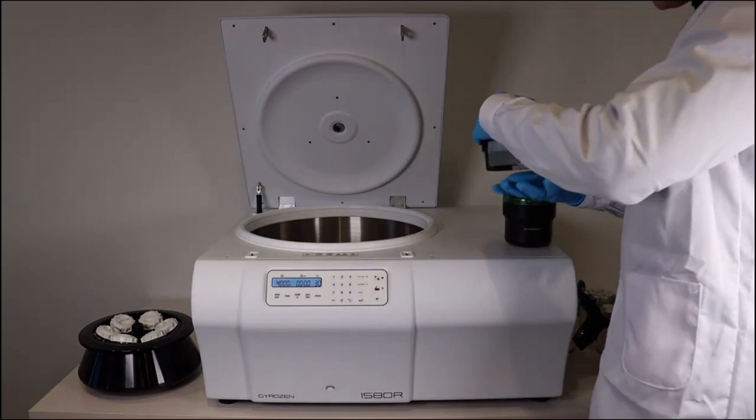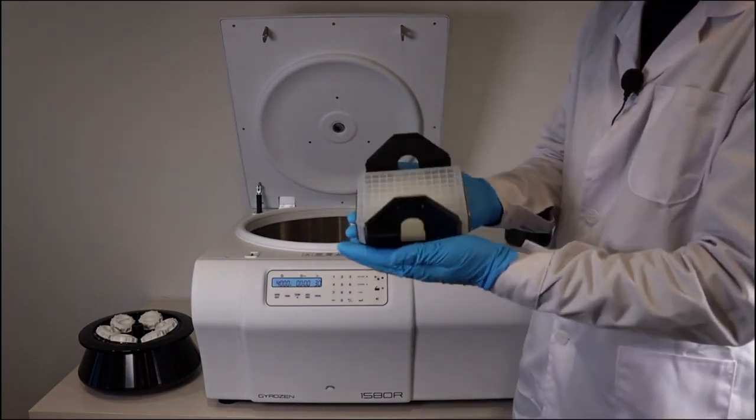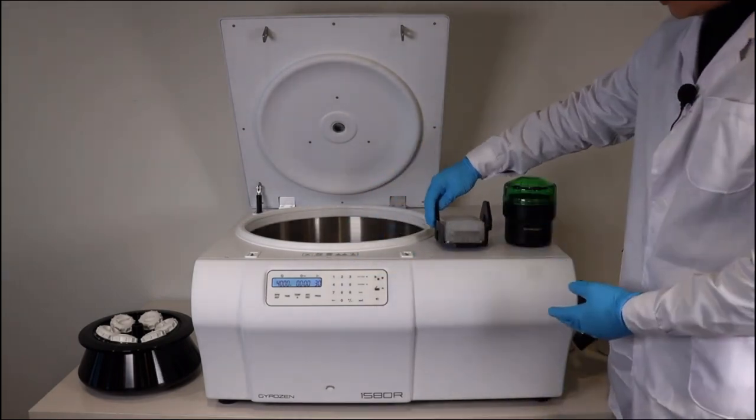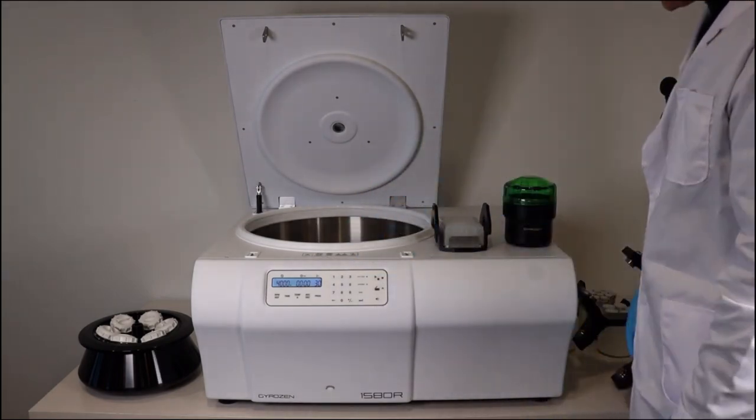There is a 32 vacuum tube rotor with a swing bucket, or 250 milliliters, and you can use 4 places of 100 milliliters. There is a maximum speed of micro-titer plates or 2 milliliters.